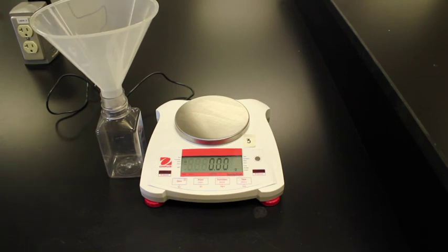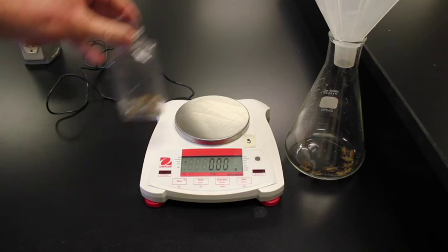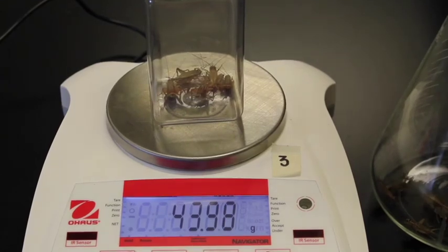And I'm going to put 5 crickets inside this container. 1, 2, 3, 4, 5. Oh, that was close. All right, so then we're going to put our 5 crickets into that container there. And now we will put the crickets back on the balance and zoom in so you can write down that value.